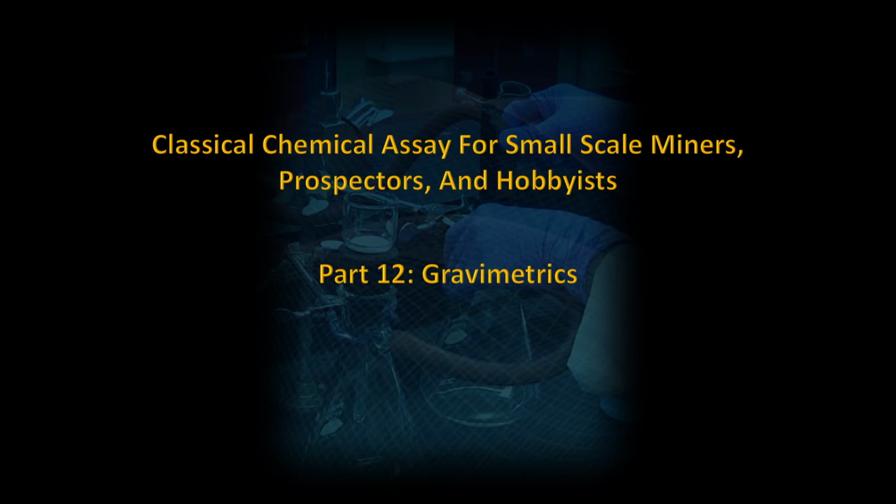In part 11 of this series, special techniques, that is to say special methods, were discussed for the decomposition of samples. Decomposition is more or less sample preparation. It is used to qualitatively separate elements from the samples, then have each element separated for quantitative analysis. Gravimetric analysis relies on the final measured or calculated weight of the elements of interest. It is the final determination which is used for statistical analysis.